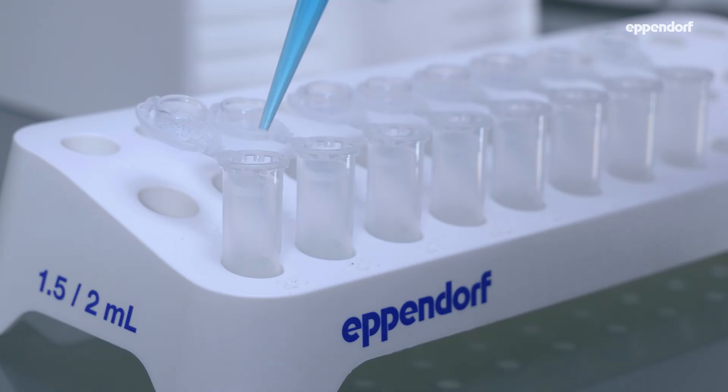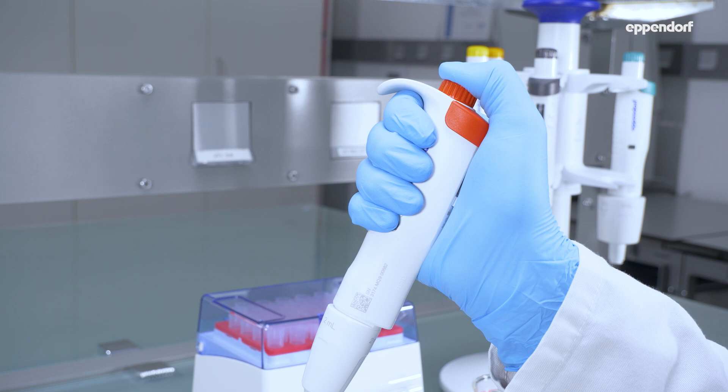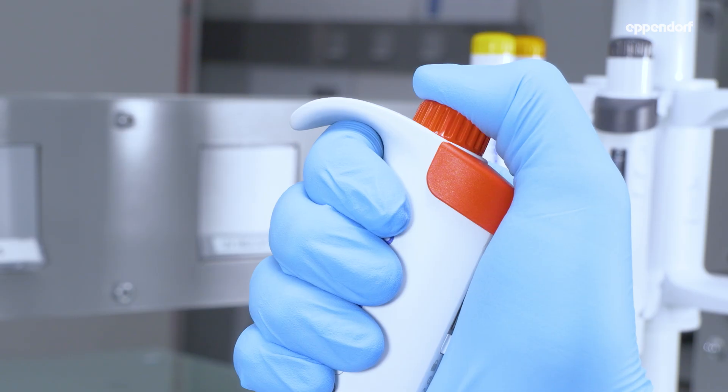Touch the inner wall of your target vessel with the tip at an angle between 20 and 45 degrees. After you've pushed the control button down to the first stop, blow out the tip by pushing further down to the second stop.